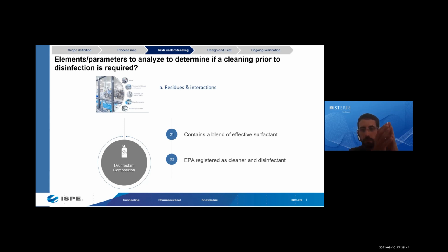Now that we have looked at, do I need to rotate 2 or 1 disinfectant, let's look at another point that is well discussed in the industry: do I need to clean prior to disinfection? So that means, do I need to have a separate cleaning using water, detergent, whatever you are using as a cleaning agent, rinse it, and then disinfect? It's a good practice after a detergent to rinse it, because the detergent has a lot of surfactant, which can leave a lot of residue that may interact with your disinfectant, except if you can demonstrate the contrary. So it's a good practice to rinse between.